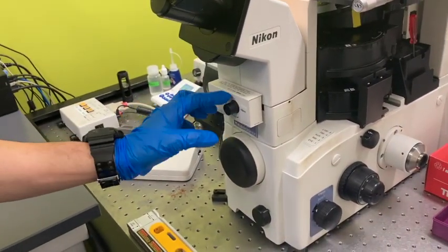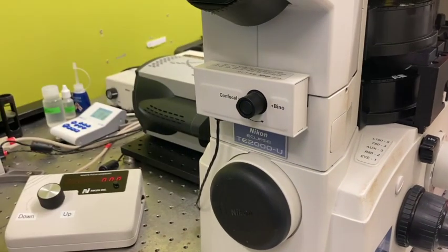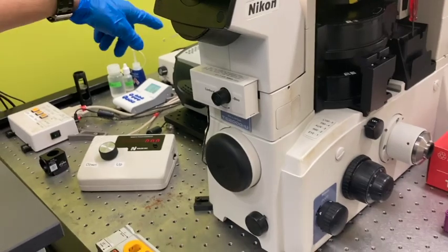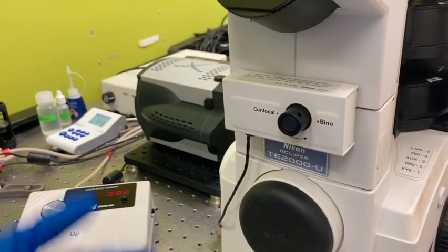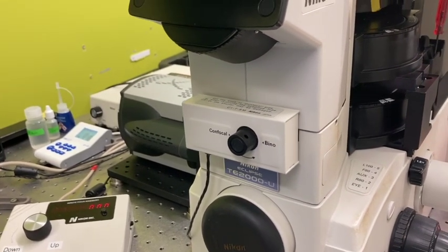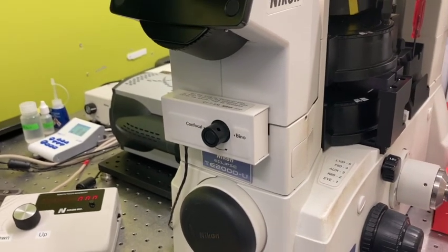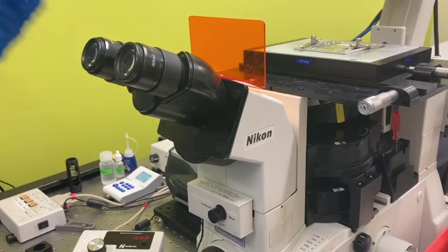But this is a switch for if you want to see the sample through the eyepiece or through the camera. If you switch to this binocular, the light will come through this, and it's dangerous because if you have very high laser intensity, the laser will reflect to this, and it will damage your eye.